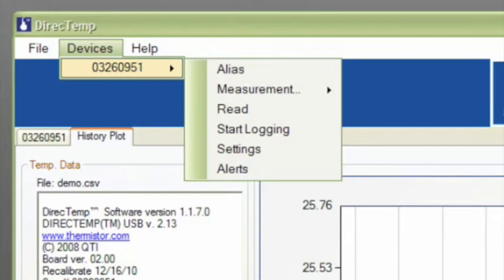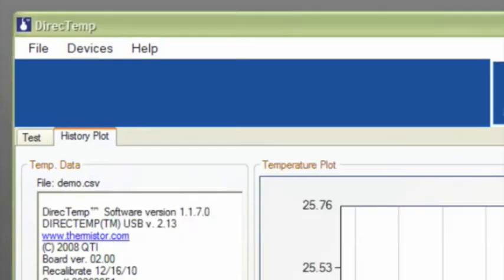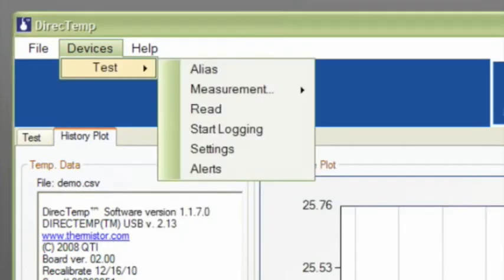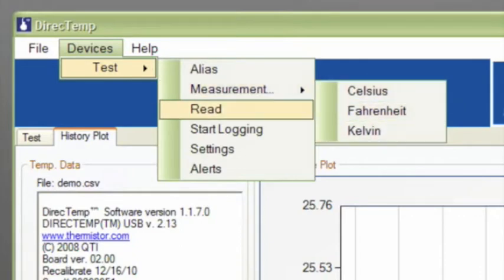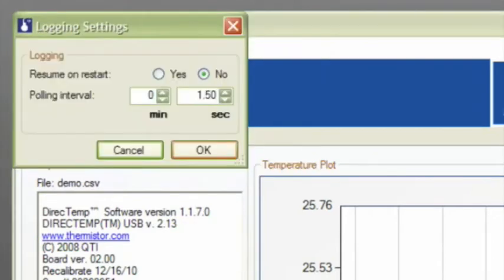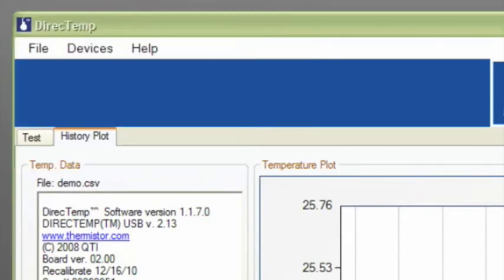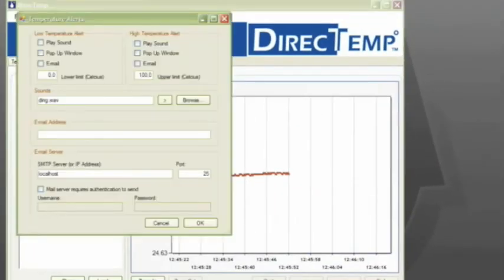By clicking on a particular probe, you can change or give the probe an alias, change the unit of measure, begin reading, start logging data, change your settings like the polling interval, and also set alerts.